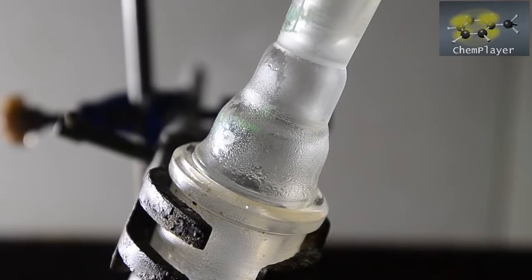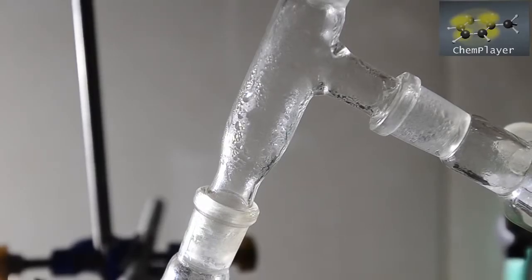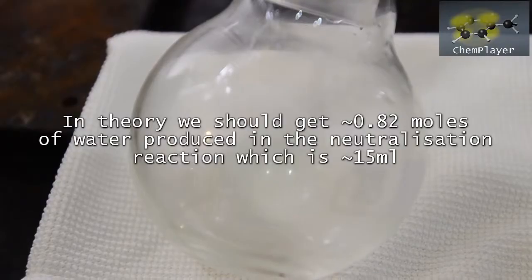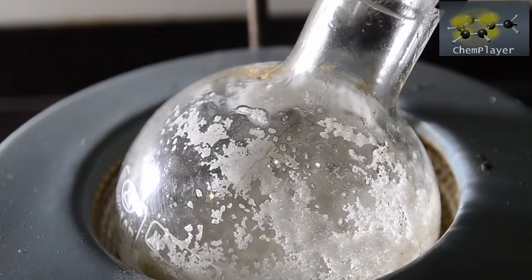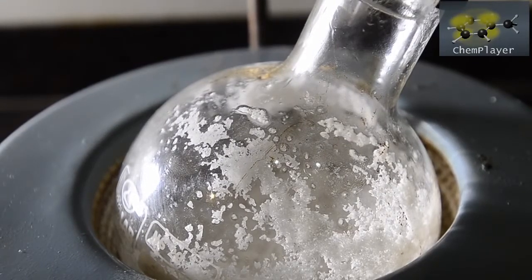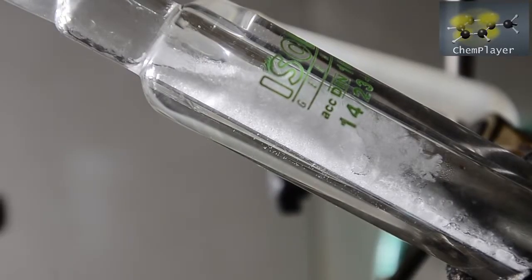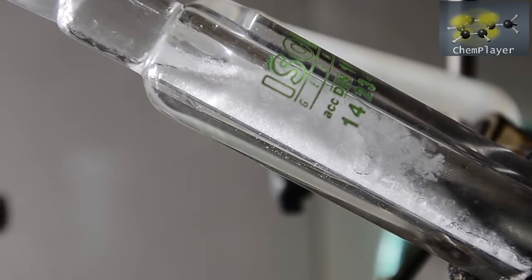Pretty soon we get water condensing and then distilling off. Once we've got about 15 ml of water, we start heating the flask more strongly to see if we can get a reaction to take place. After about 20 minutes we notice a white deposit starting to form and build up in the condenser.